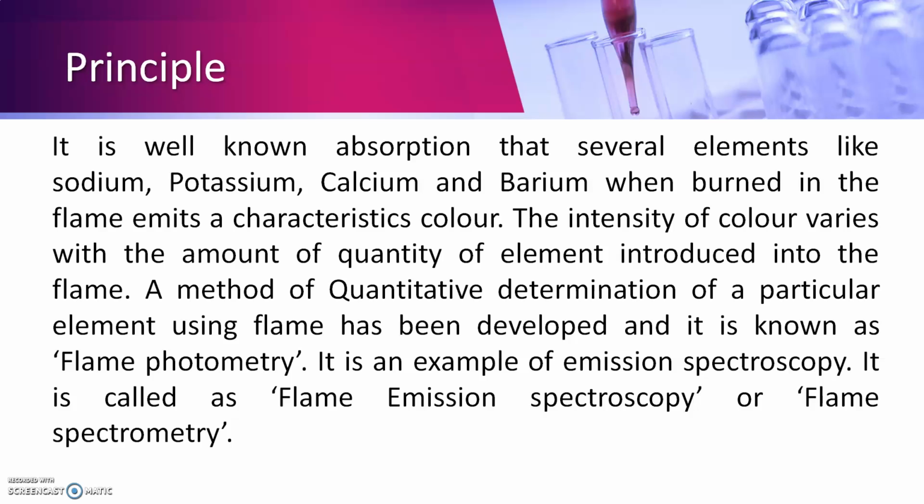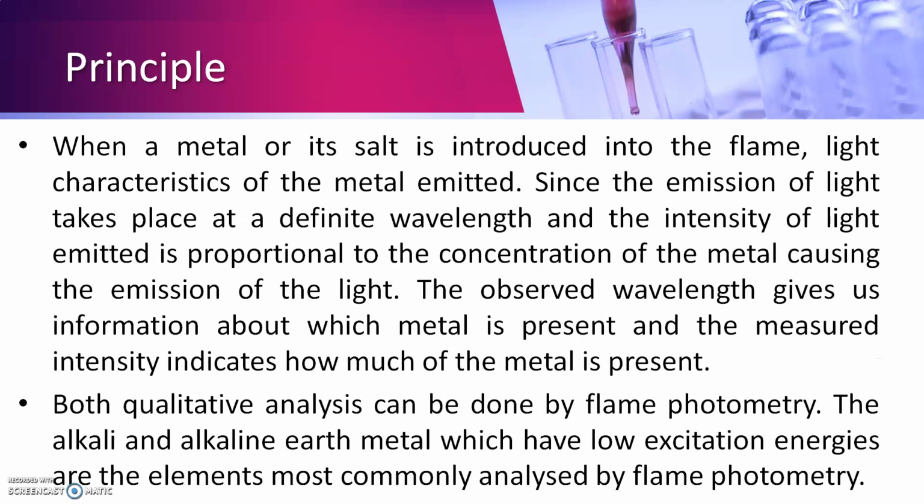So it is an example of emission spectroscopy, and it is called flame emission spectroscopy or flame spectrometry. When a metal or its salt is introduced into the flame, light characteristic of the metal is emitted.